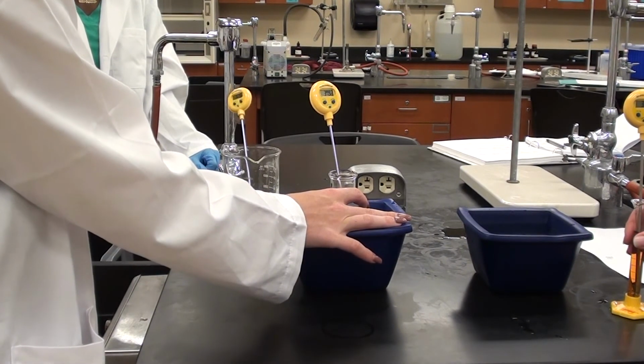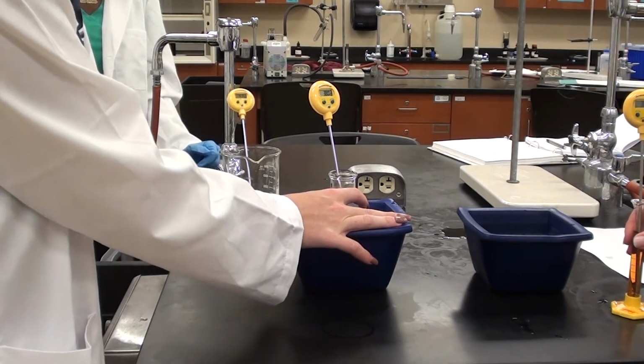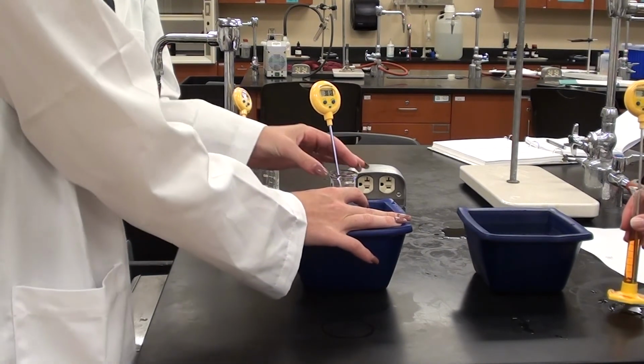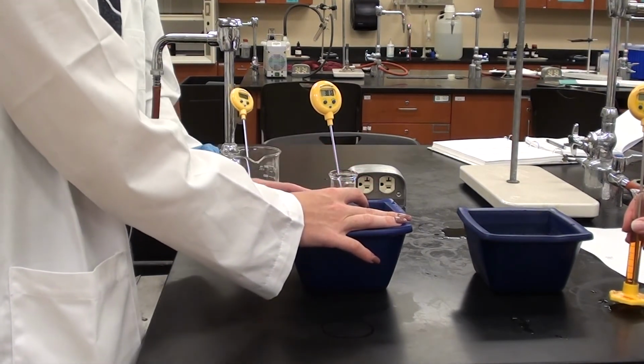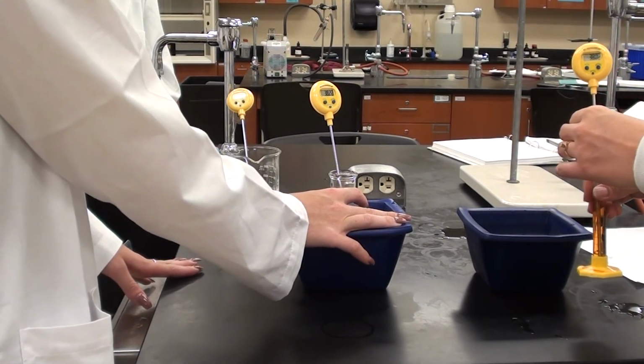I think what we'll do is we'll get this to 38 degrees and we'll do it there. What's it at now? 38. Just hit 38. Yeah, just hit 38. So go ahead, Sarah, and add the iodine to Delaney's solution. But make sure you're timing it, right? You need to time it.